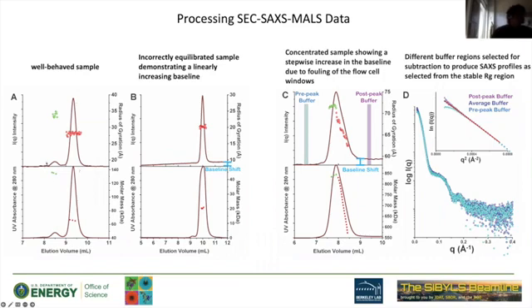You are also welcome to reanalyze the data, as was already shown by Steve yesterday. The package also includes this SEC-SAXS profile with all the frames together in an HDF5 file format, and you can directly upload it to RAW. I will give you an example in a minute.